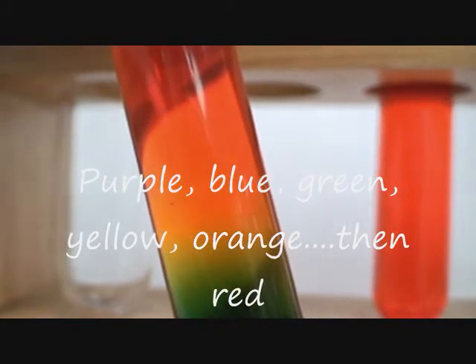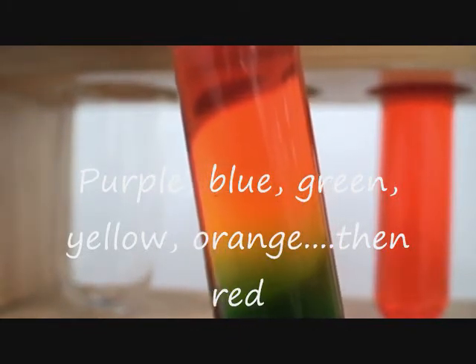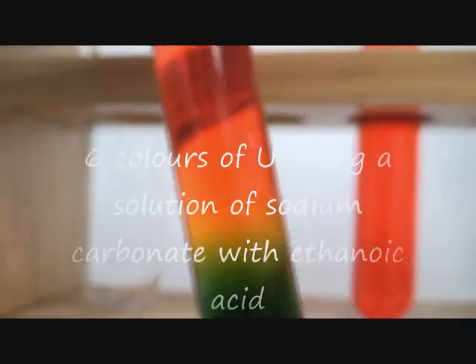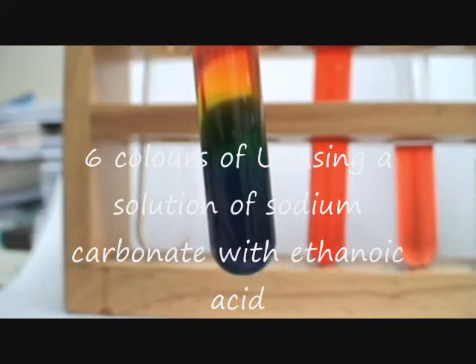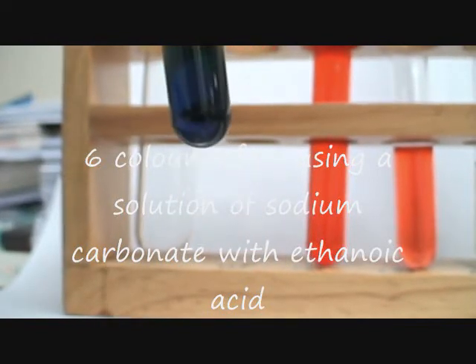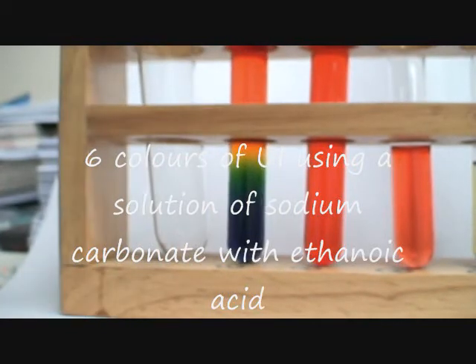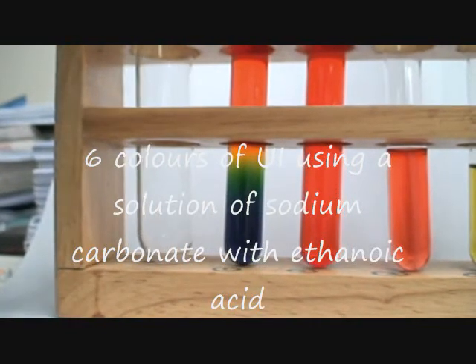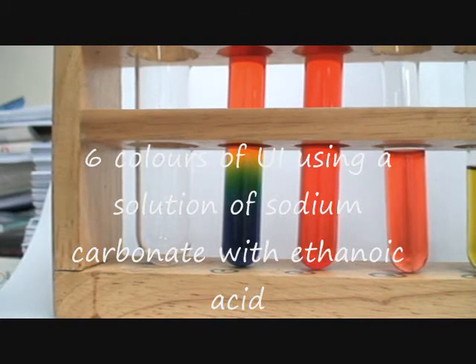These seven colors are obtained by gradually adding ethanoic acid to a solution of sodium carbonate. I have put this on the web before where the procedure has been listed. Thank you.